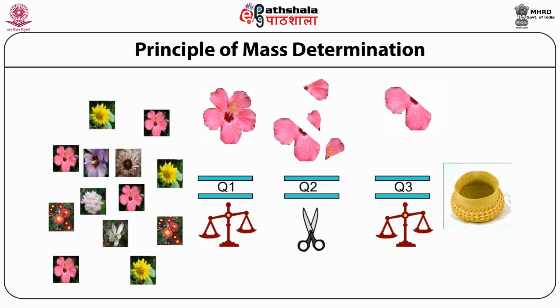When it comes to quadrupole 2, it is bombarded with a neutral gas molecule like nitrogen or argon. Here the weaker bonds are broken, making unique fragments. Now quadrupole 3 has been set to pick up a particular fragment. Therefore, that particular fragment is a unique identifier of that molecule. The first isolation has happened: the semi-purification is the first isolation.